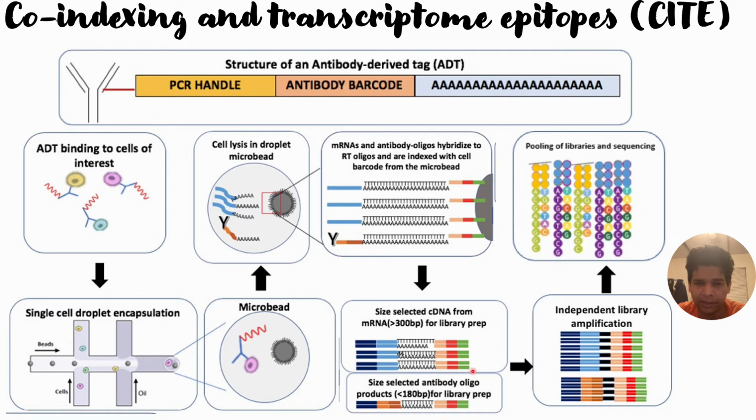Then this DNA will be further amplified independently, followed by NGS sequencing or any other single cell sequencing.